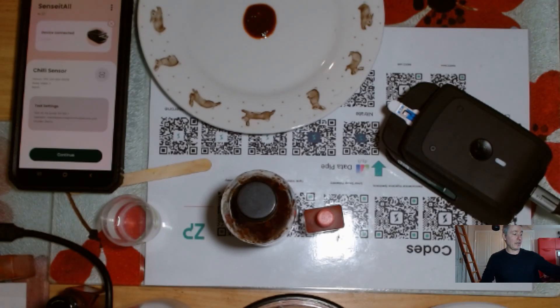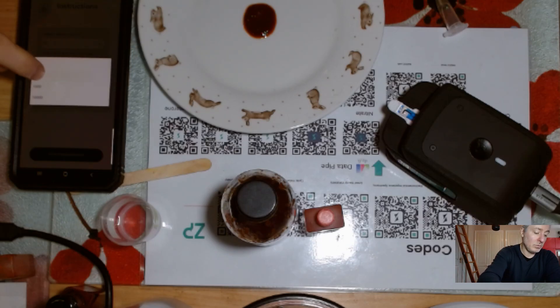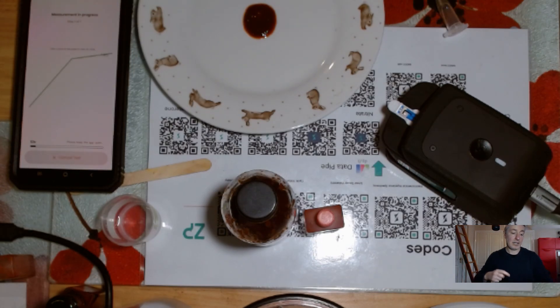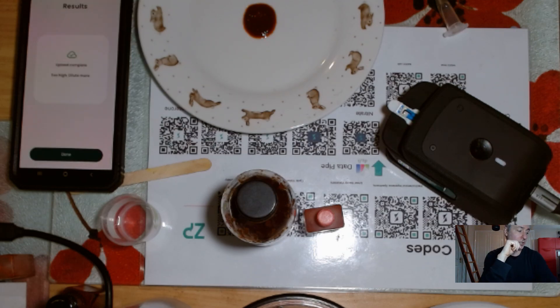I'll hit continue, make sure I choose one-in-100, and go start measurement. Off it goes. I can see that peak has decreased in intensity but it's still quite intense. We'll see what the app says when it's finished — it says 'too high, dilute more.' So we did one-in-ten, one-in-100, and it's still too high.